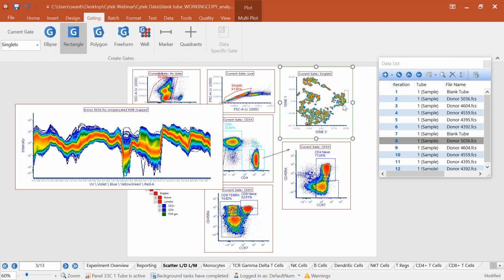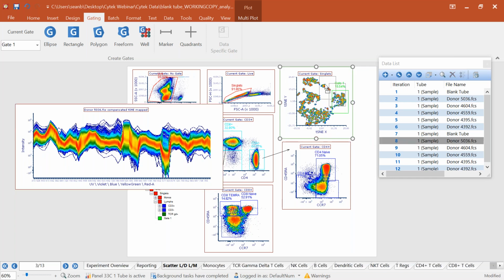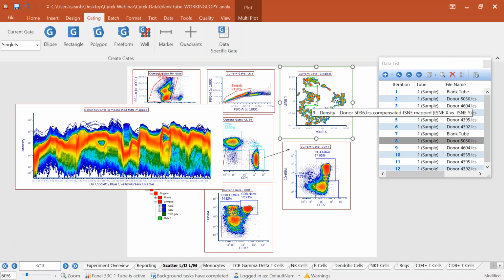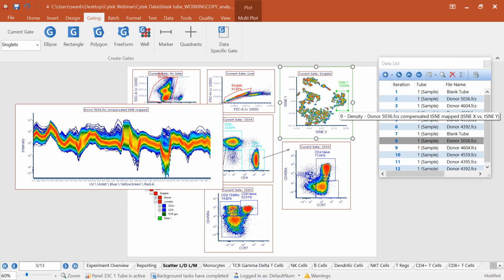But the really powerful tool that I'd like to see some people playing with is being able to set a gate on a t-SNE plot and then investigate on the spectrum plot, what does the spectrum of that clustered population look like, right? And that's something that we can achieve in FCS Express. And I think that's something very unique of the tools that we have here. Again, you can move between the t-SNE plots, you can move between the spectrum plots, and it will be really nice to see what comes of these tools in the next couple months or years, once folks start being able to use these high dimensional tools, link them up to the spectral data, look at what the spectral fingerprints look like for clustered populations. It will be really interesting what comes out of that.